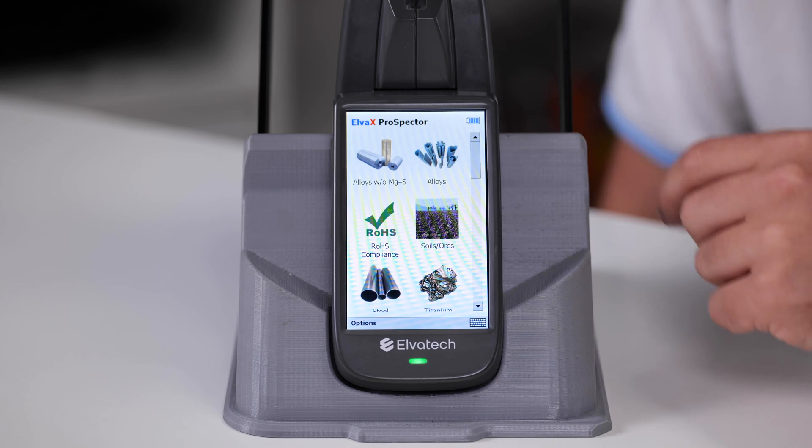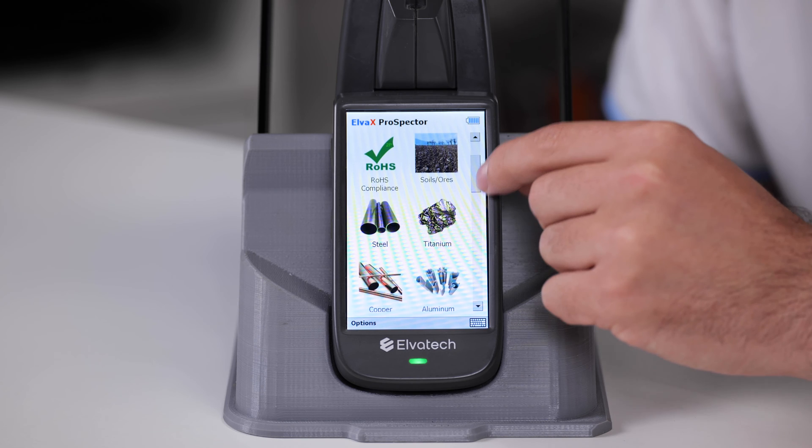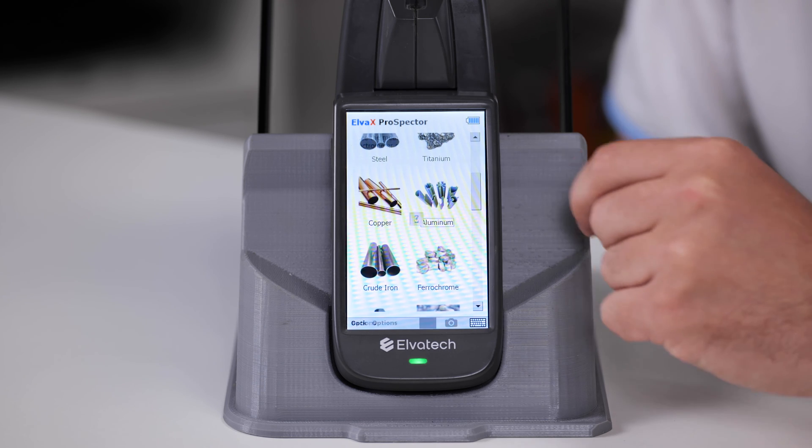Third, switching between calibrations. If you need to analyze different types of material during analysis, be sure to switch to the appropriate calibration. Using the wrong calibration can lead to inaccurate or incorrect results — it can lead to underestimation or overestimation of elemental content. If your analytical task changes during operation and you do not have the proper calibration, for example if you start working with new types of materials, contact the manufacturer to recalibrate the analyzer. Remember: use the correct calibration, keep track of changes in analytical tasks, and periodically check the quality of your measurements.